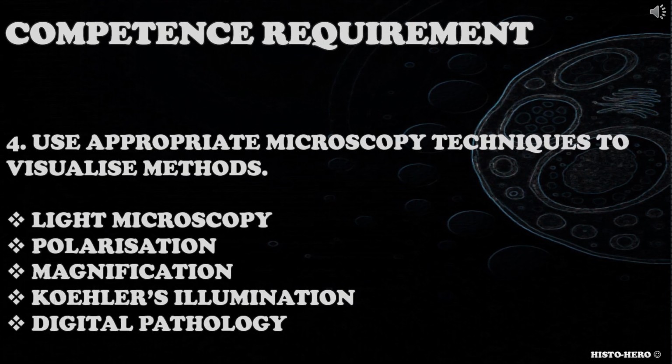The fourth competence requirement is for you to use appropriate microscopy techniques to visualize methods. What type of microscope do you use to demonstrate methods for pigments and minerals? Consider light microscopy in general, polarized light for minerals with crystalline structure, magnification, Kohler's illumination, digital.